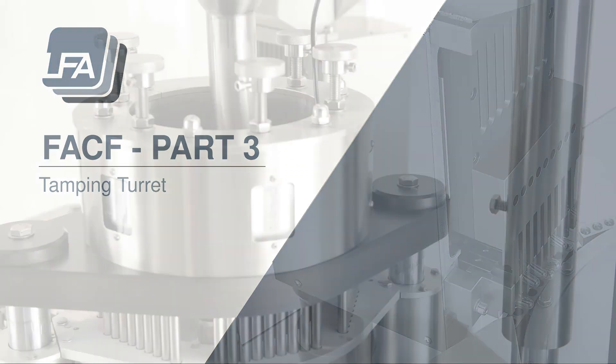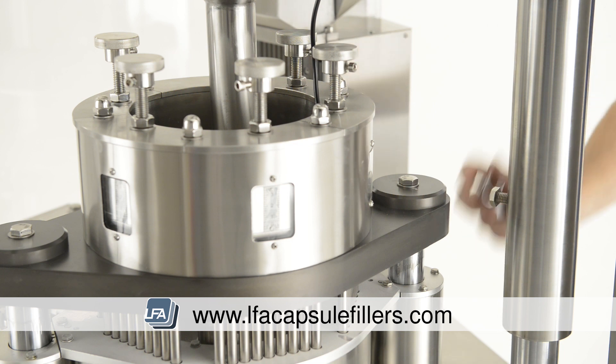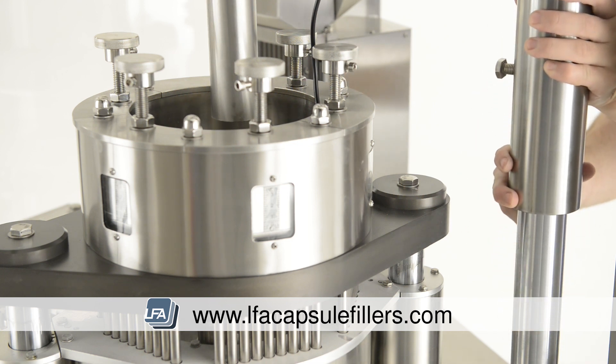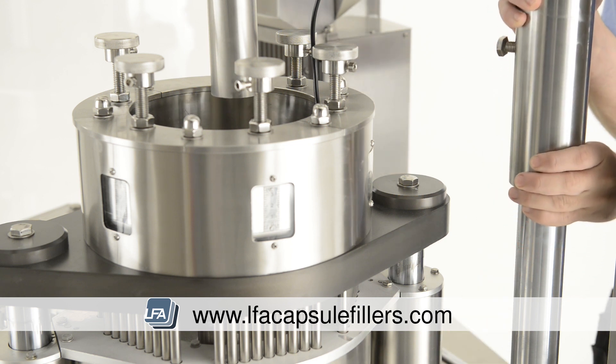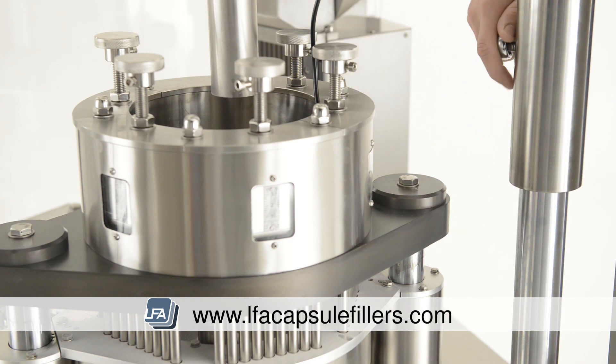Next is the tamping turret. We need to change the tooling in the tamping turret. First loosen the bolt on the side of the top section — this will allow you to raise the top part of the machine and remove the hopper. Once raised, re-tighten the bolt.